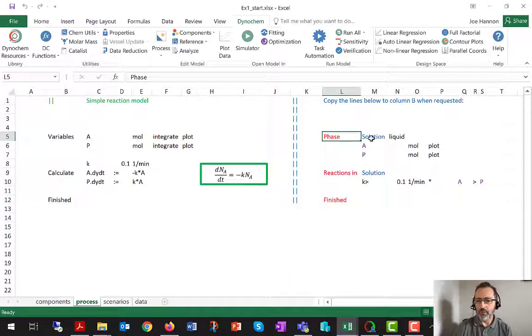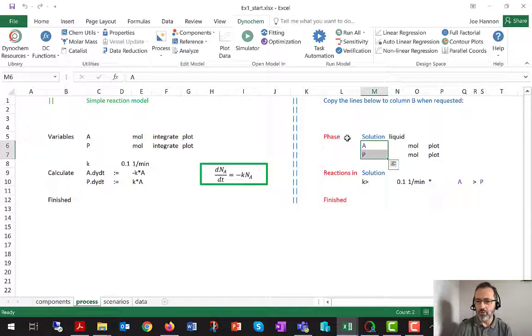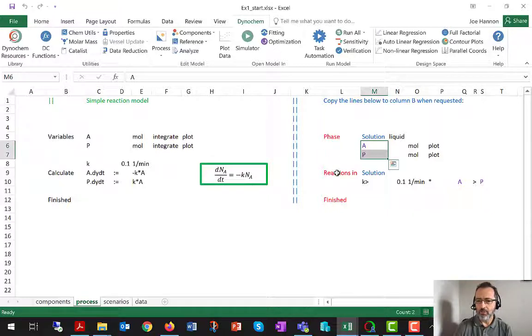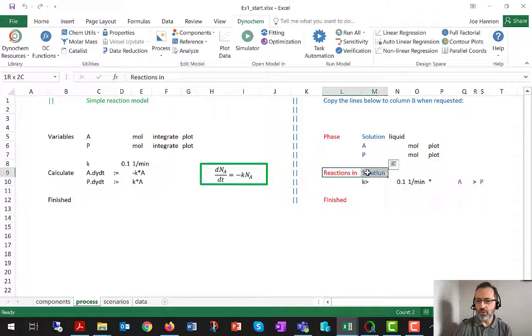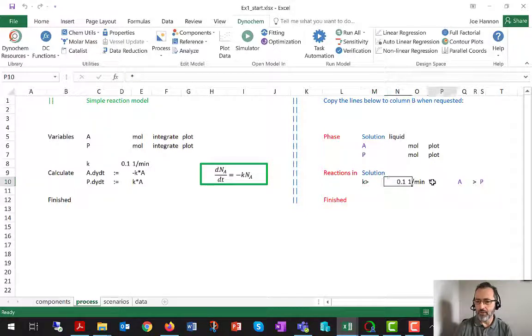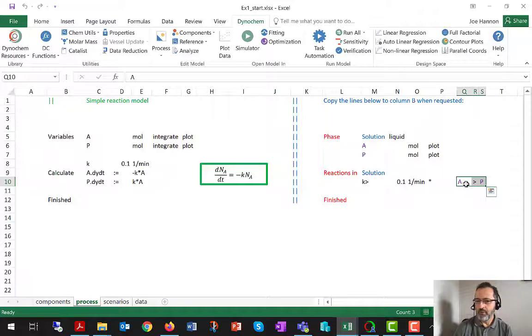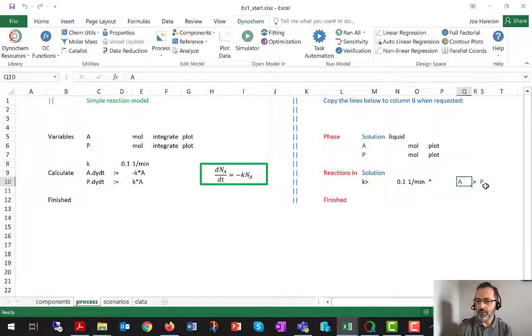It's got the phase statement. It's a liquid. It's got the two violet-colored components under the phase definition. It's got reactions in solution, the reaction statement. It's got the rate constant. It's got the asterisk to say here comes the chemical mechanism or the balanced equation, and it's got A goes to P.